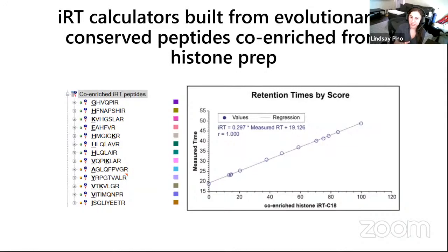We do the trypsin digestion, so everything should end in an arginine, not a lysine, because we've modified all of our lysines. And then finally, we do another round of the propionylation. So now all the N-terminal peptides are modified as well. So these, we tried to get peptides that don't have internal lysines. Of course, a couple of them do, but we tried to focus on peptides that did not have internal lysines so that they wouldn't be modified.